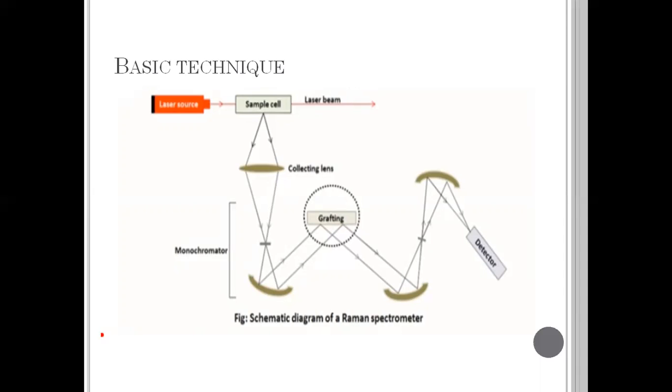and so aqueous solutions can be studied using Raman spectroscopy because the sample signal is not swamped by that of the solvent. These reasons collectively ensure that Raman spectroscopy is particularly well suited to the study of biological systems. For example, it can be used in the study of the spectrum of myoglobin.